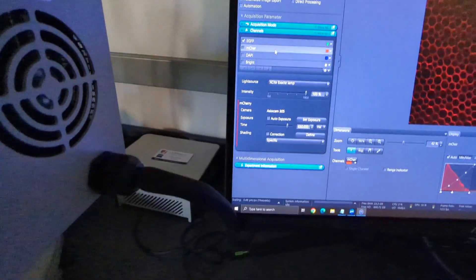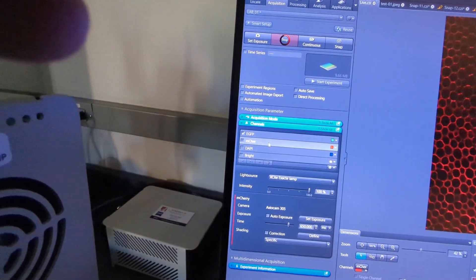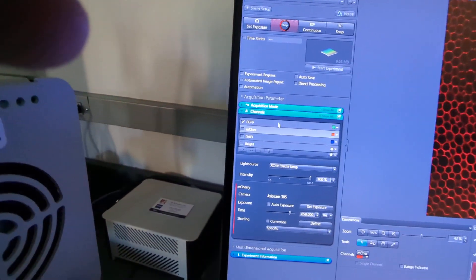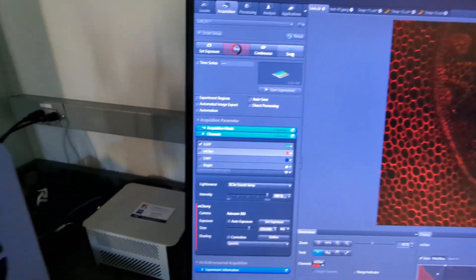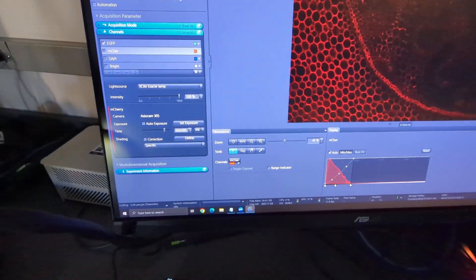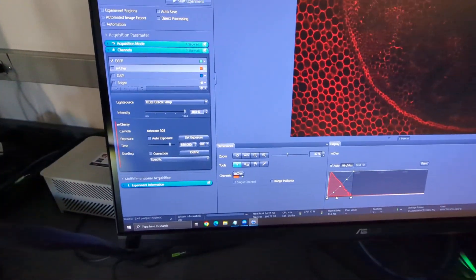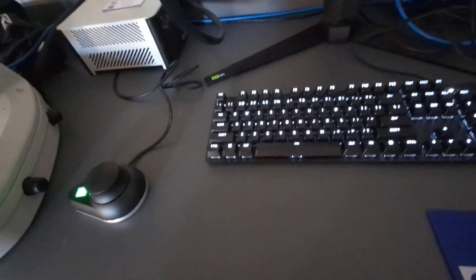And then the light is on when I clicked on it, and then if I hit snap I do all my adjustments like we did before, hit snap and it's, oh actually it's a different one, okay.